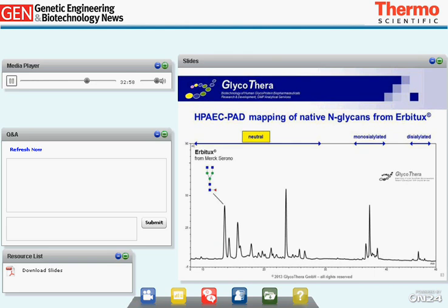In the neutral glycan group, we see diantennary N-glycans without 2 beta-galactose residues, the oligomannosidic Man5 glycan, diantennary N-glycans without 1 beta-galactose residue, where both isomers were detected, and diantennary N-glycans. These N-glycans are typical glycan structures from the Fc fragment.